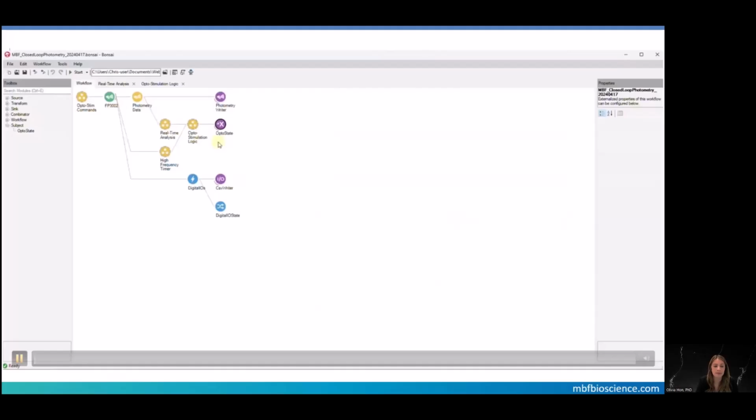This workflow requires some calibration to be successful. In particular, the buffer duration property and the indicator cutoff property need to match the type of signal that you're working with. For example, if you're expecting short duration peaks, you might not want a large window size that can contain many peaks at a time. Or if you're expecting sharper, more prominent peaks, you might consider having a lower, more restrictive indicator cutoff value. If you do not know what to expect, it's best to characterize your signal a bit before running this workflow.